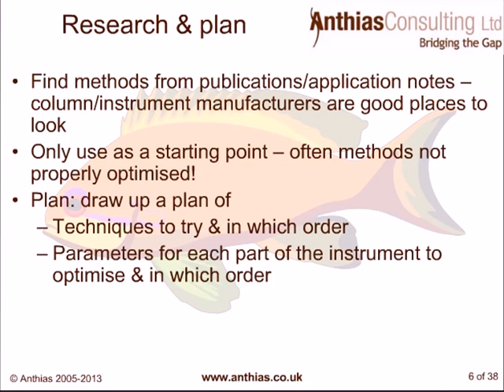And of course, it may not always be the manufacturer that you use for your instruments itself. It could be other manufacturers. Only use these areas as a starting point, because often methods are not fully optimized, especially I tend to find in publications, because a lot of the time people make do with what they've got. And you might have a whole range of instrumentation, some of which may be much, much better for your application.